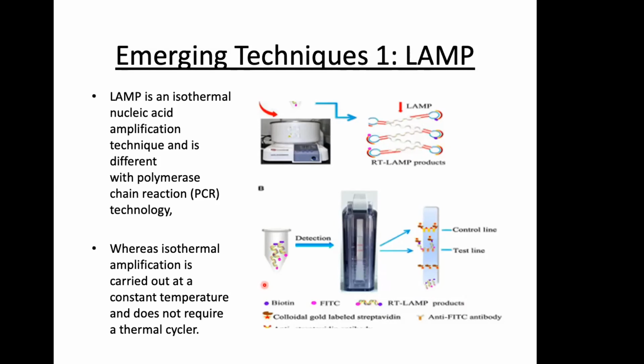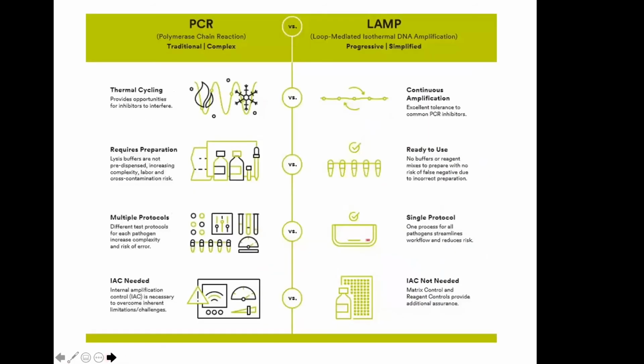So this will be an exciting alternative detection system because it is still based on the virus, not based on the antibody, not based on the S protein or N protein, but based on the virus itself. And instead of using complicated, expensive RT-PCR, we can replace it with LAMP, okay? But that depends on how good your primers are. The primers can be designed via some software, so then we can test them in the lab.